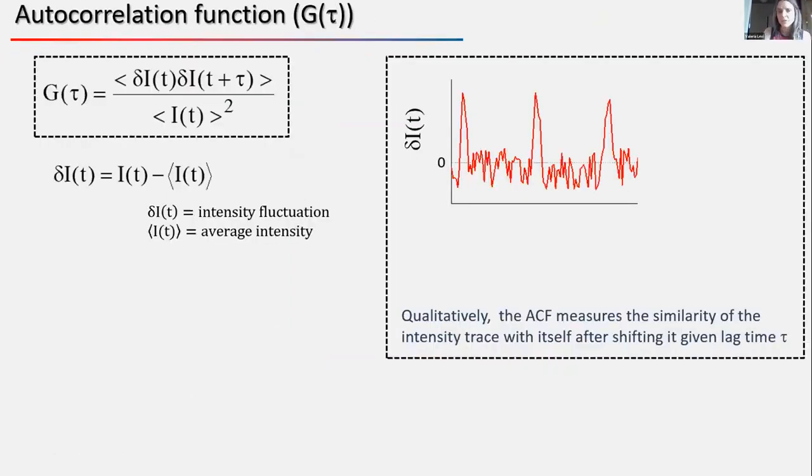So Enrico explained to you that this information can be obtained through autocorrelation analysis. Just a brief overview, because I know that you are learning a lot of new concepts. Going back to the basic idea, perhaps it will help you to understand these techniques. So the idea is the following. You have in here the autocorrelation function.